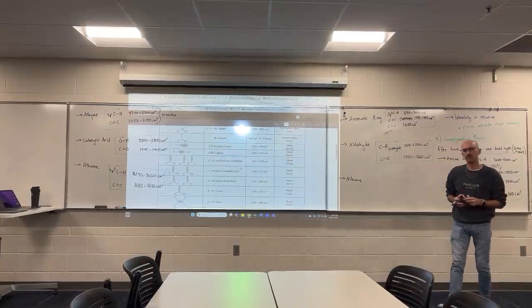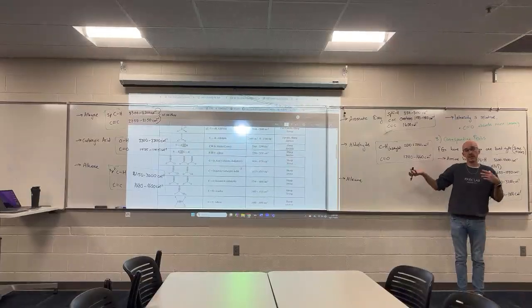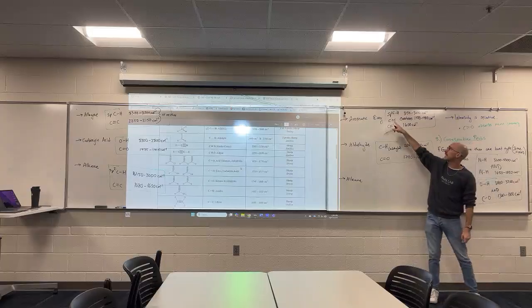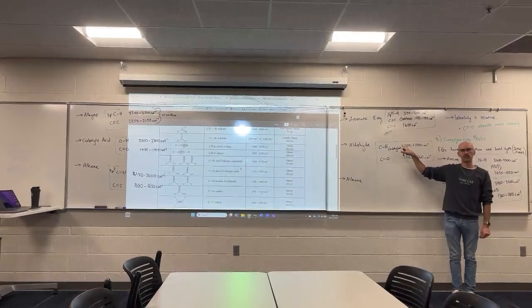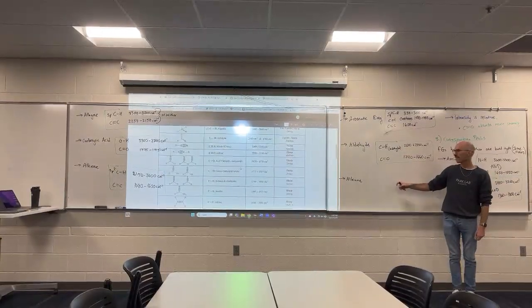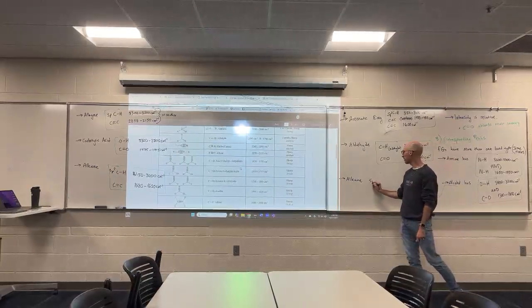Yeah. Ultimately, on the document that you guys submit, I'd like to see hybridization and or bond type, but with these, hybridization is something I really want to lean into. sp3CH, sp2CH. The aldehyde, CH aldehyde is great. And remember, there's wrong answers in your analysis assignments, but that's why I give you guys feedback to try and go back and understand it better.